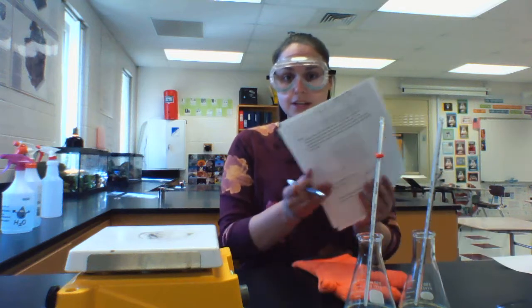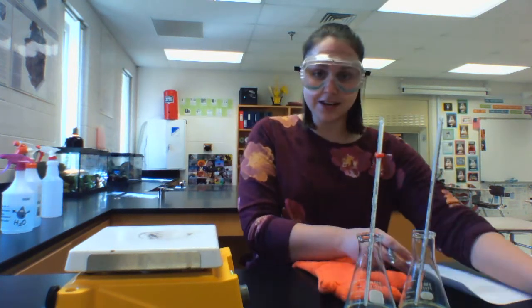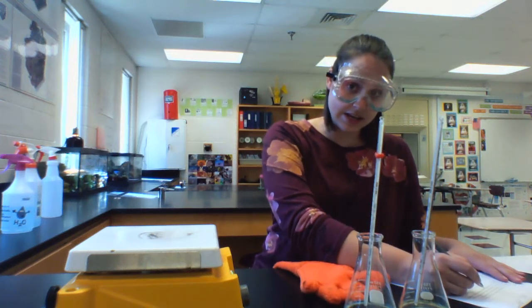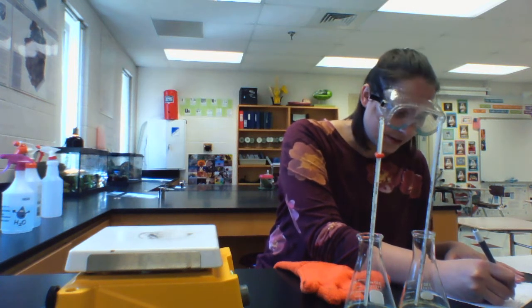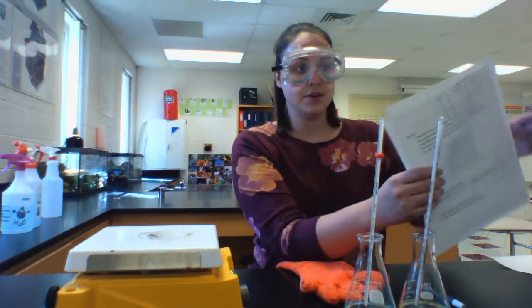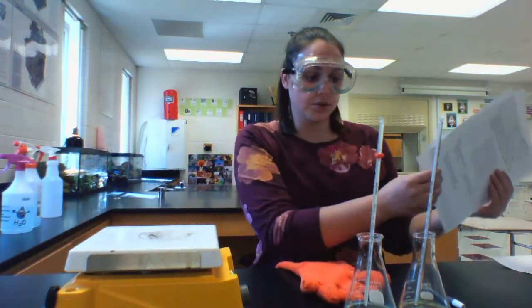So on my data sheet that I'm going to put a picture of in your lab activity, I am going to record that at 0 minutes using heat, we are at 24 degrees Celsius. You can see that here, and I'll upload this document as we continue to work through this lab.